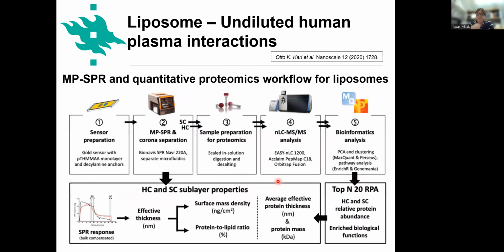Then we are very much interested in measuring the protein corona formation of nanoparticles, because that actually determines where your nanoparticles end up in vivo. And oftentimes researchers use techniques that are very invasive, and they use spinning down of particles after exposing particles to serum. So basically you can somehow disturb the actual protein corona.